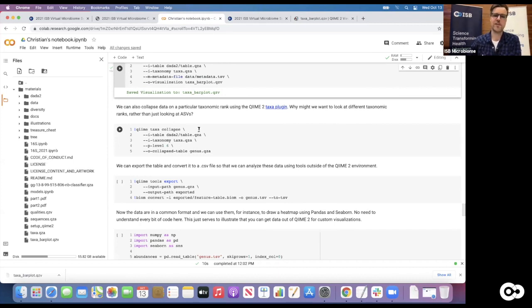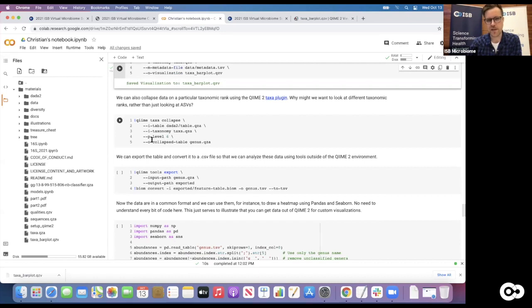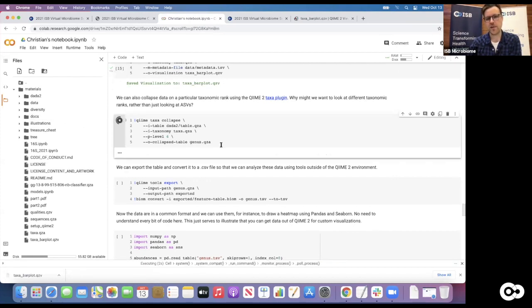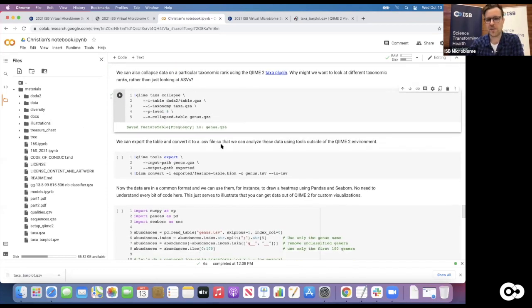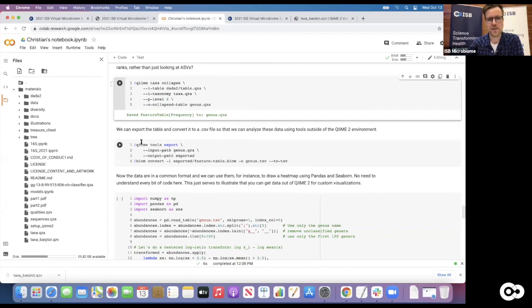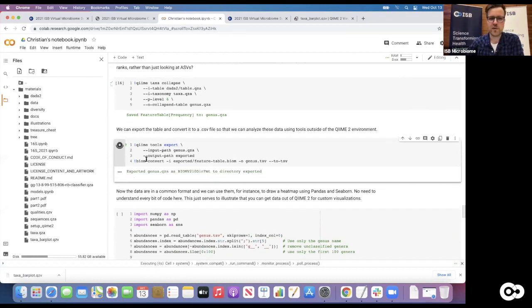Our abundances are still at the level of individual amplicon sequencing variants, so we'll summarize them at the genus level. For every sample, we look at all amplicon sequencing variants belonging to one particular genus - like Bacteroides - and sum up the counts. We add our abundance table, taxonomy table, and specify level six, which is the genus level, and generate a 'genus' QZA artifact. QIIME 2 only converts artifacts to artifacts, so we then do a two-step process: an export command to export the file format, and then convert it to a TSV table. That's necessary because abundance tables in QIIME 2 are saved in a binary format called BIOME, which is great for biological matrices but we want a normal tab-separated file.